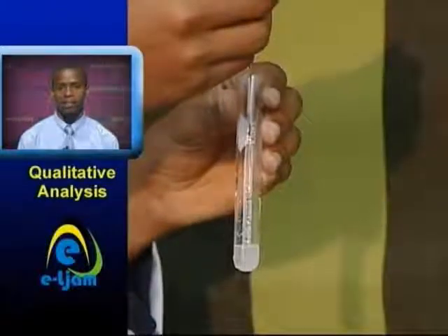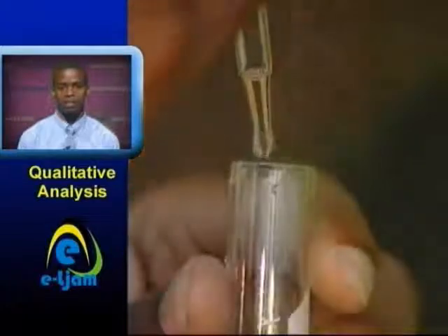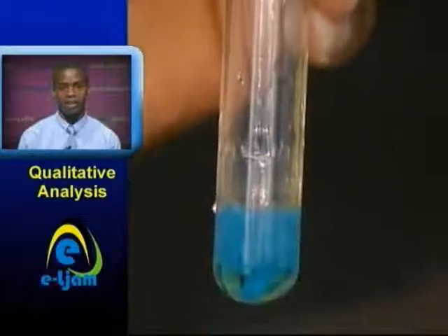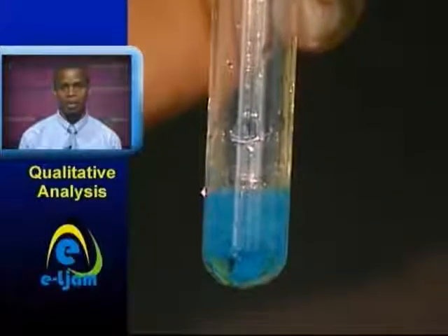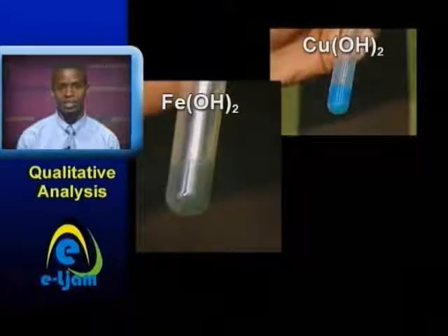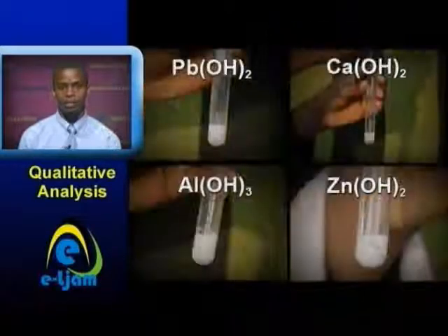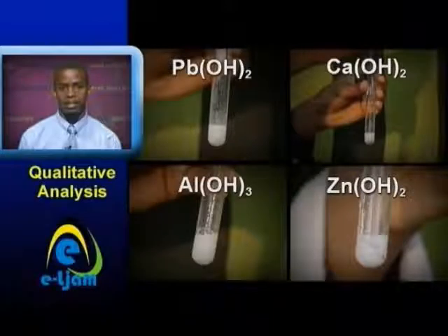The metal cations form insoluble hydroxides with sodium hydroxide solution. The precipitates formed are colored as follows: copper 2 hydroxide, blue; iron 2 hydroxide, dirty green; iron 3 hydroxide, reddish brown. All other precipitates appear white.